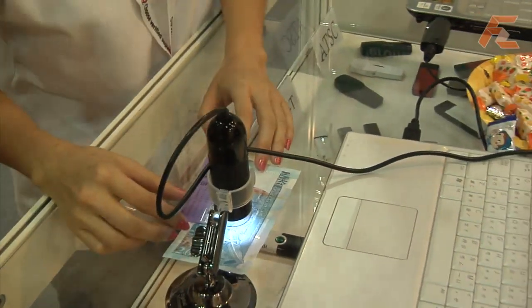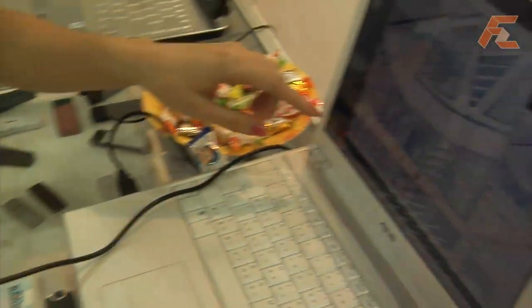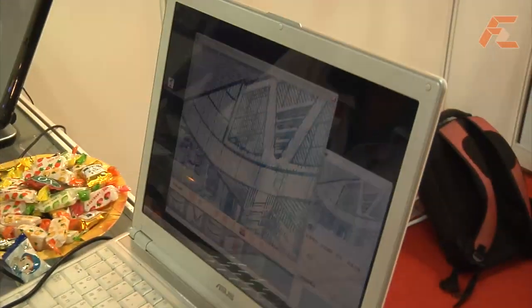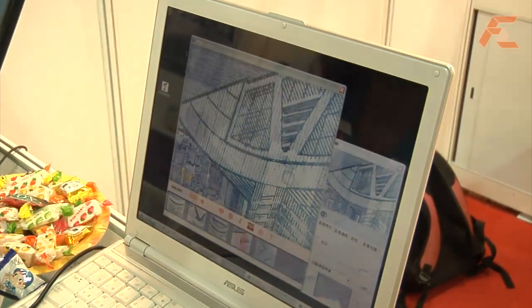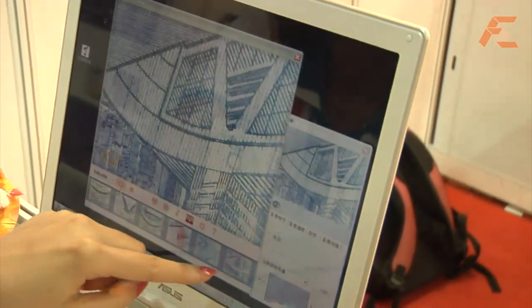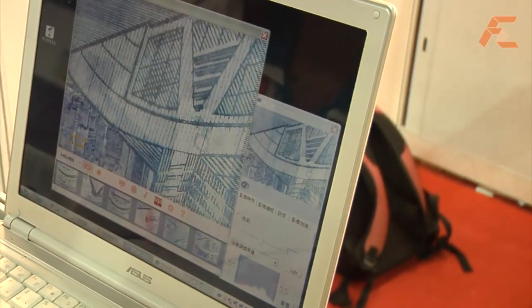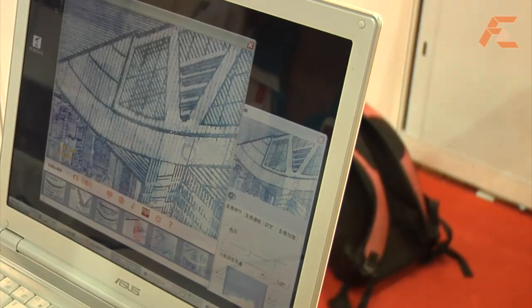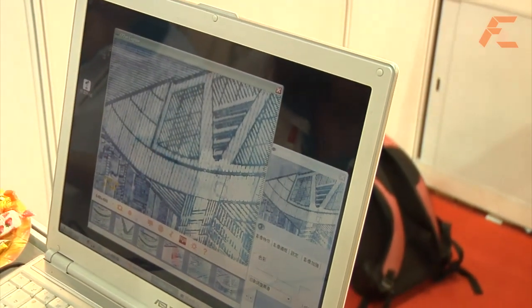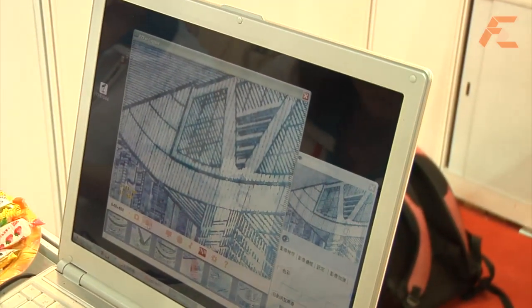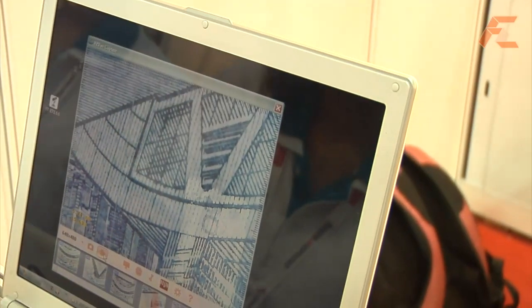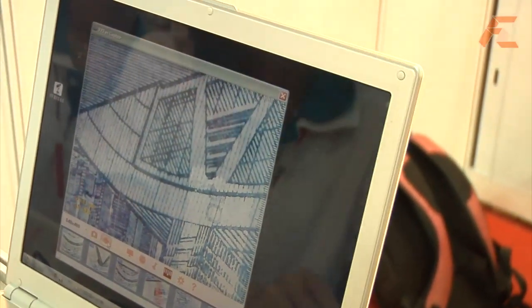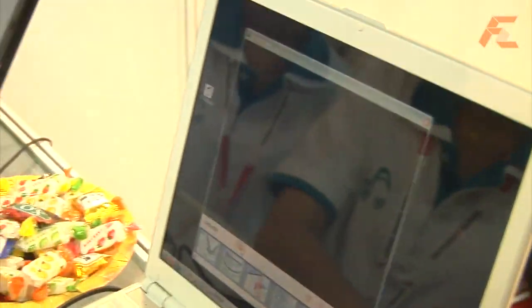Our product can take pictures and record. Take pictures with this button, like this — the picture appears here. And you can record with this button. So you can take pictures and video clips under a microscope condition.